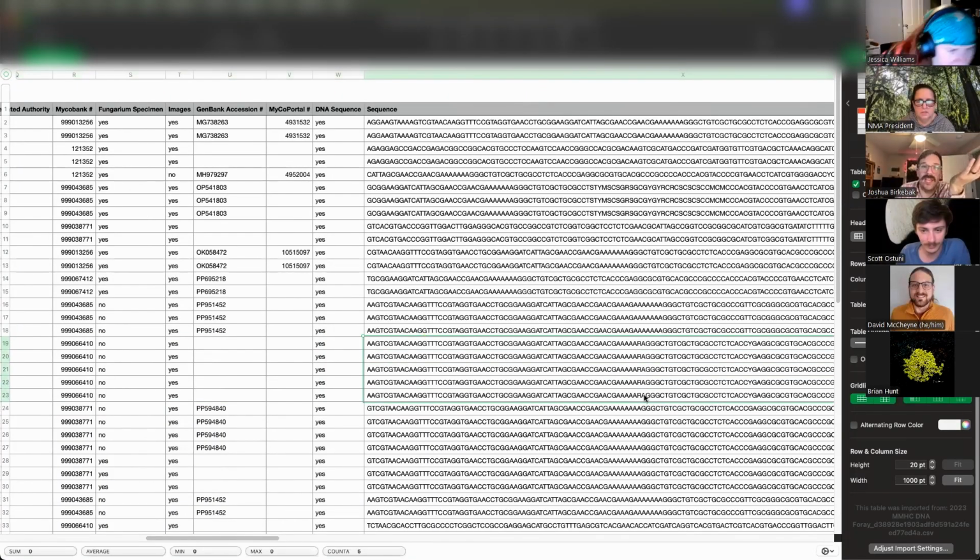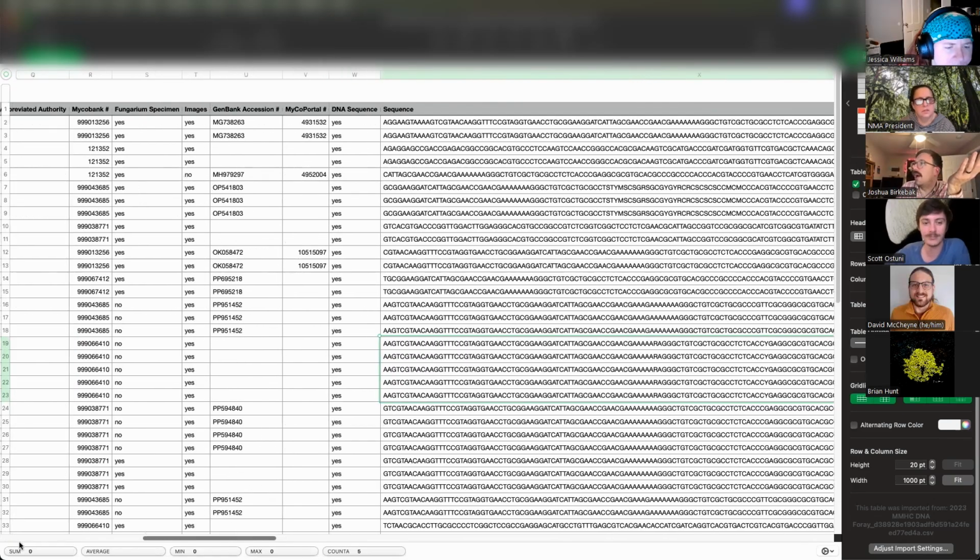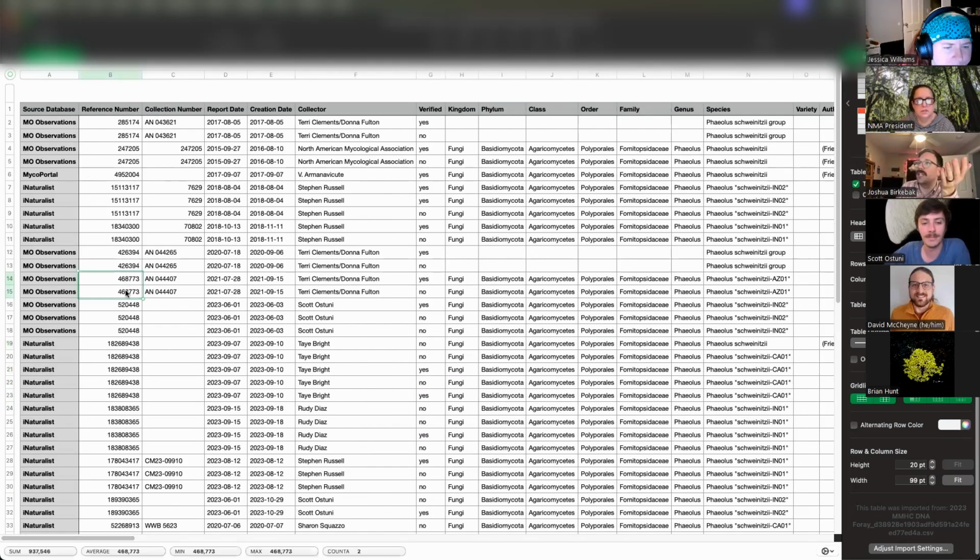I don't know why that is. So you just go through and delete the duplicates out. I don't know why, but it does that where you get the same thing multiple times. My only guess is maybe that it's to do with how many sequences were originally clustered in MycoMap, but then it overwrites them with the real one.